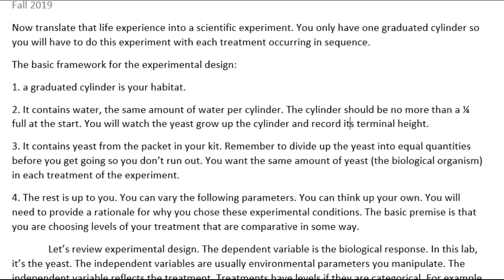The graduated cylinder also contains yeast from the packet in your kit. Remember to divide up the yeast into equal quantities before you get going so you don't run out. You want the same amount of yeast, the biological organism, in each treatment of the experiment. The rest is up to you.